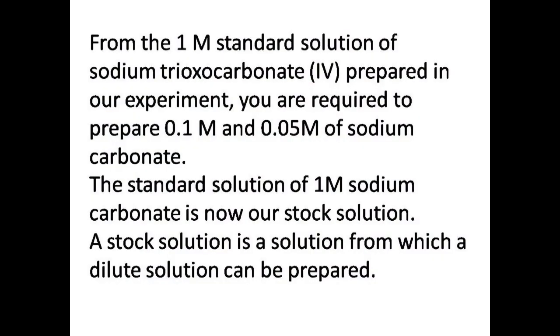From the 1 molar standard solution of sodium carbonate prepared in our experiment, we are to prepare 0.1 molar and 0.05 molar sodium carbonate. Now, these solutions are of lesser concentration.